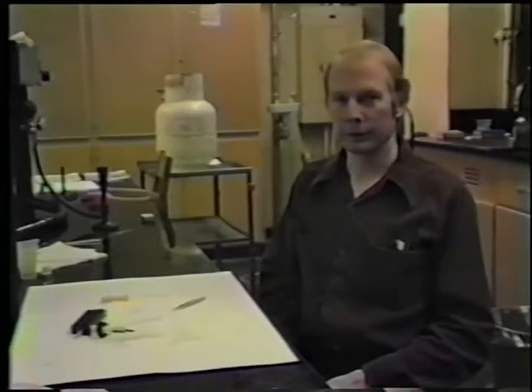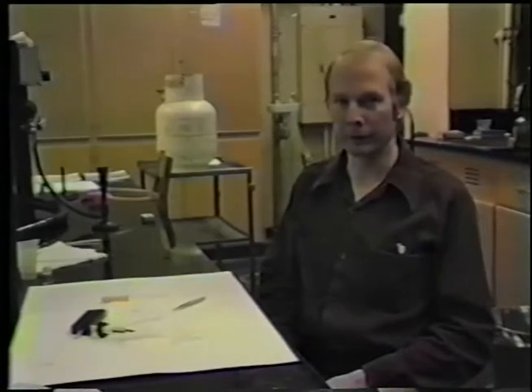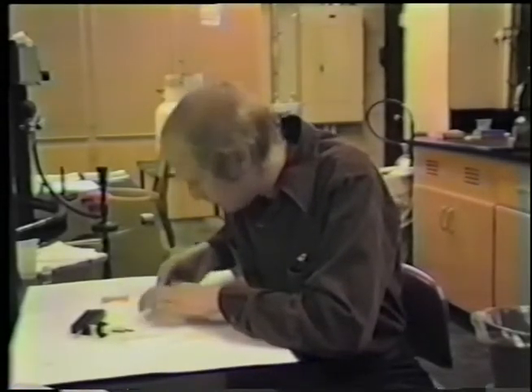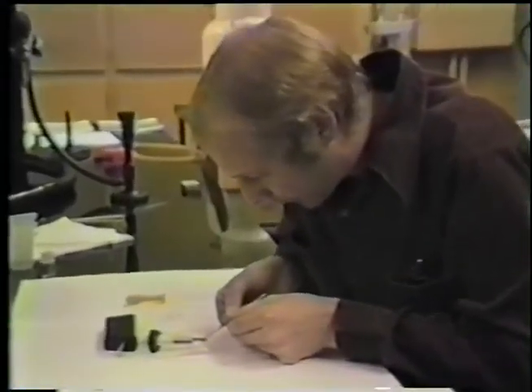Under actual working conditions with a real biological sample, one would prepare the sample much more quickly than the demonstration that I just gave, in order to prevent drying of the sample in the room air and damage due to the effects of the copper.